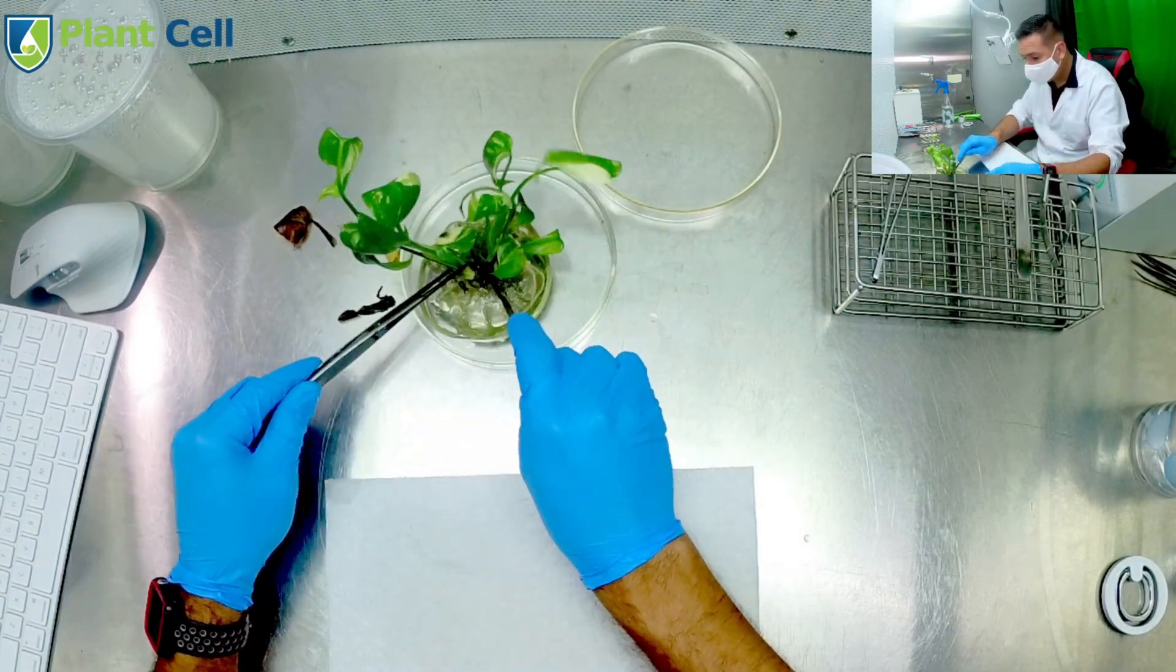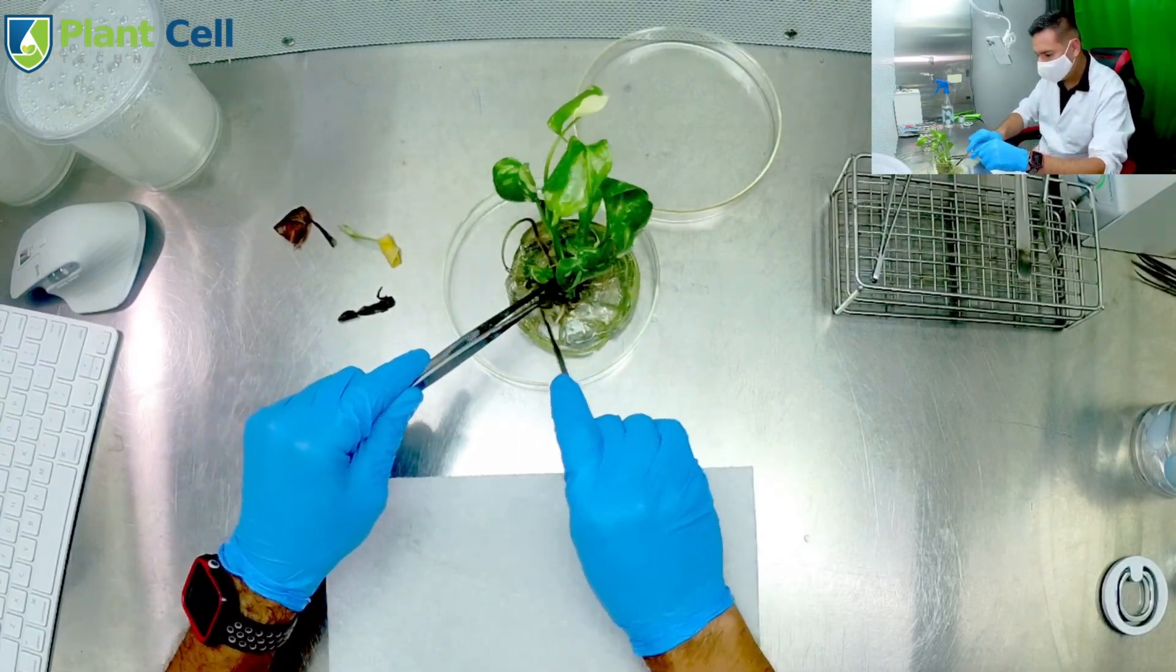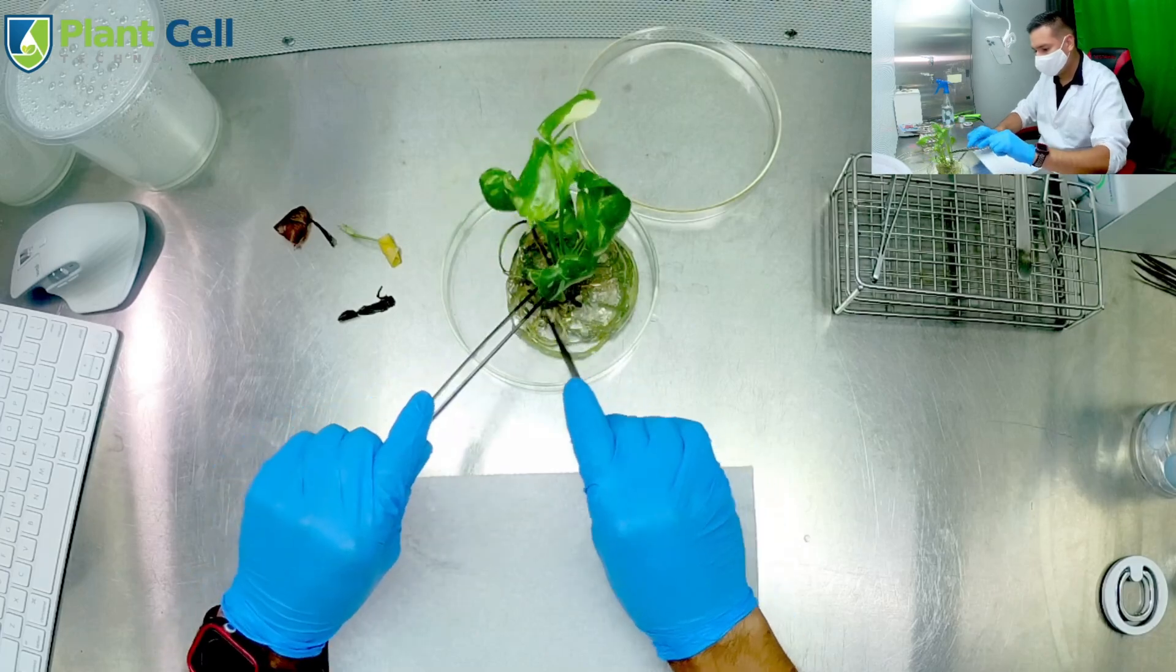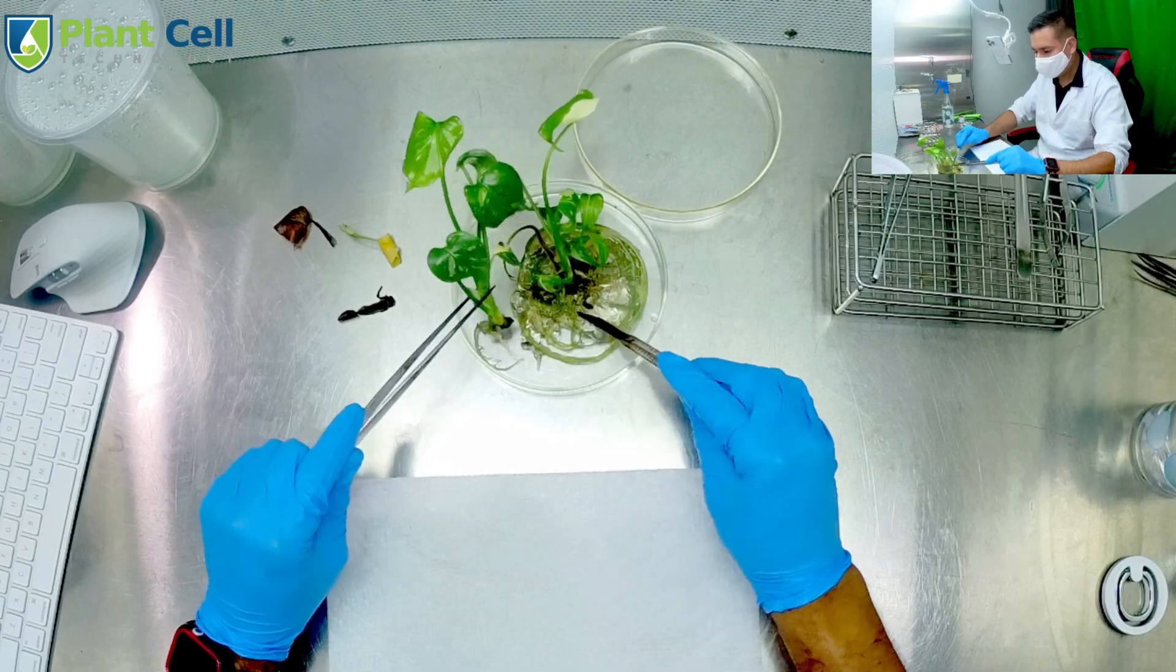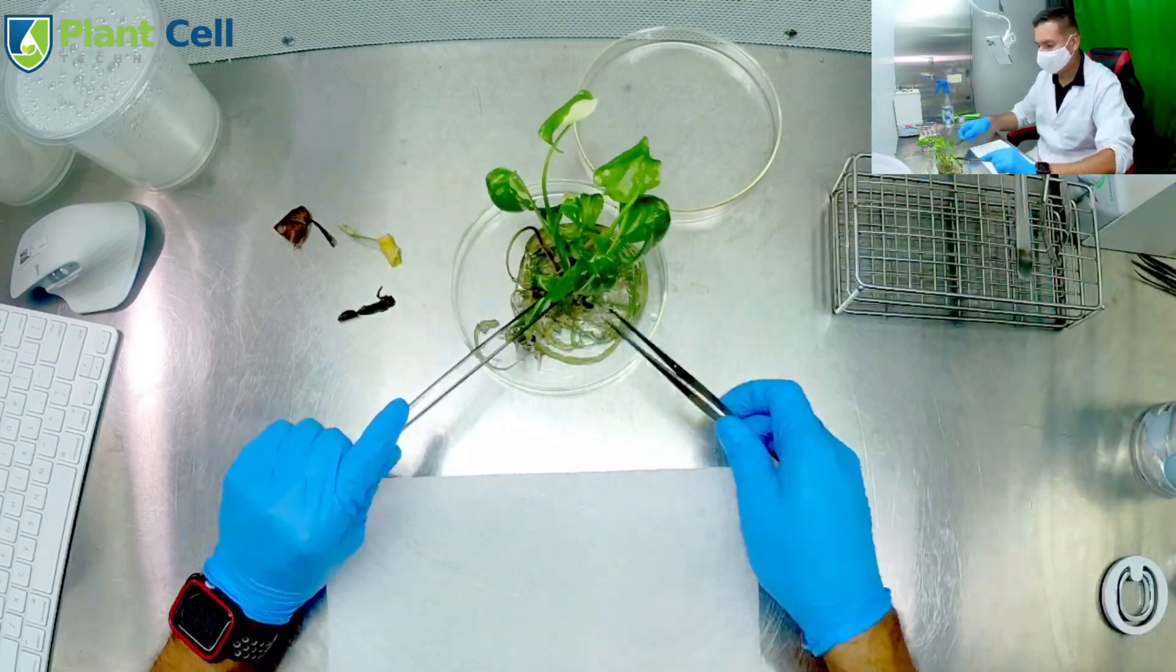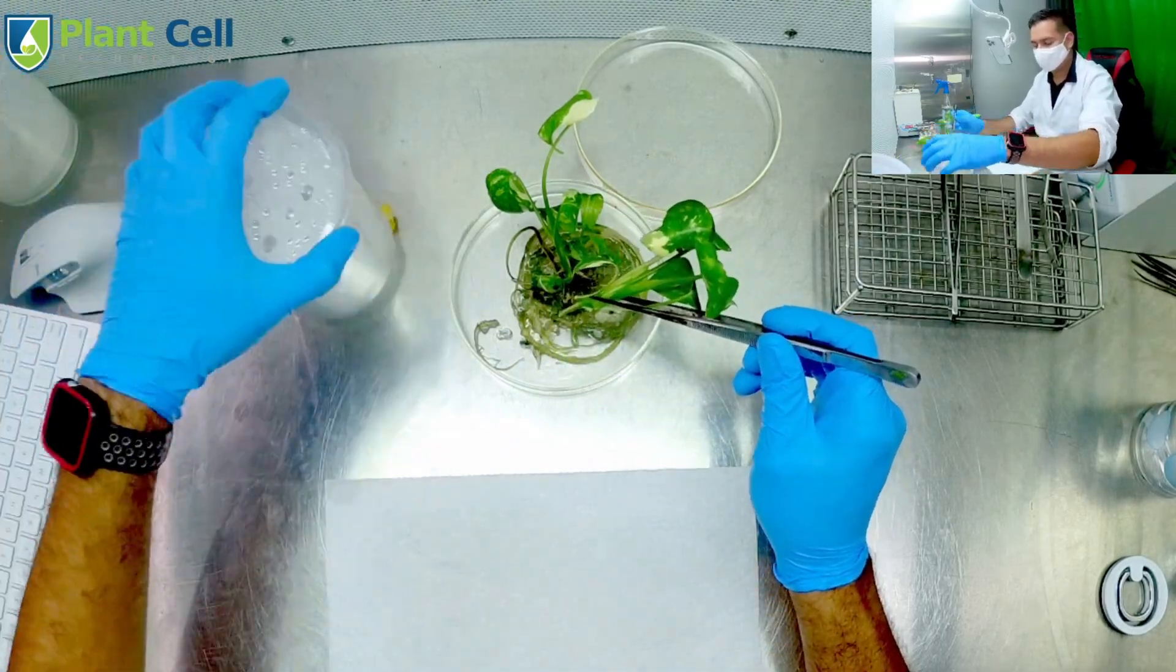And it has given me really great results. I mean, you can see these plants look amazing. They are big and they have a lot of roots. However, if you want to multiply more plants, you do not want that many roots. You want multiplication. So for this time I'm placing two plants back in the same media.